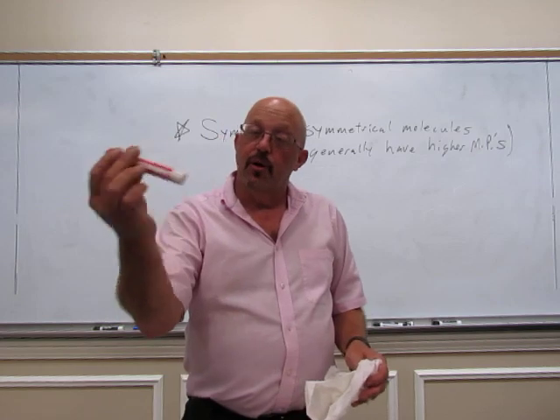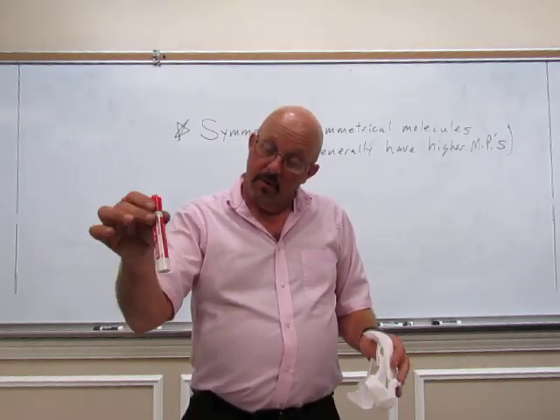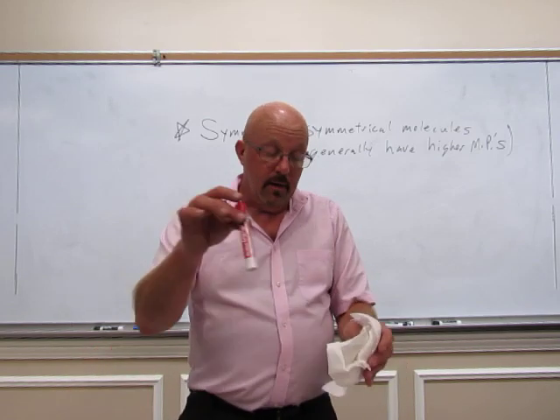Take your reaction tube, we'll say this is your reaction tube that you've just recrystallized. So you got it up to boiling. As soon as it gets to boiling and it's all dissolved, no more solid in there, take it off.